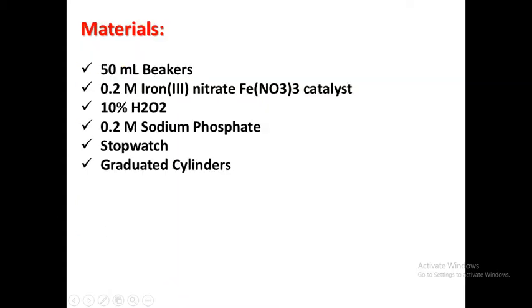Materials used in this experiment: 0.2 molar iron nitrate as the catalyst, 10% hydrogen peroxide, 0.2 molar sodium phosphate, and glassware: beaker, cylinder, and stopwatch.